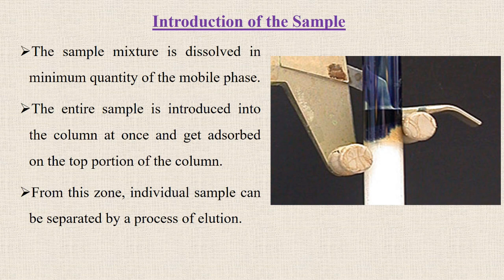The next is the introduction of a sample. A solid sample can also be applied, but it is preferable to dissolve the sample in a small quantity of mobile phase, and it is introduced as shown here at the top of the stationary phase. Before introducing the sample, some sand is kept here so that the sample or mobile phase does not disturb the stationary phase.